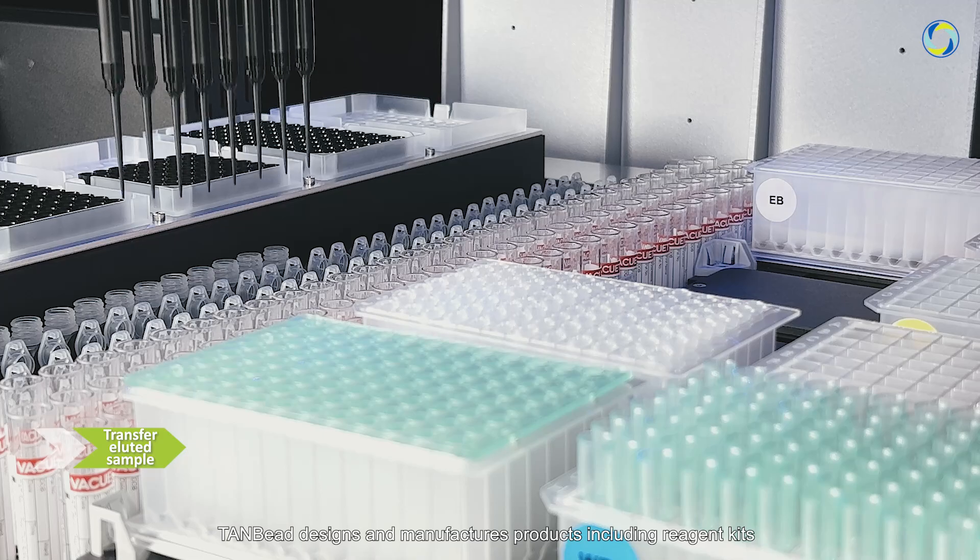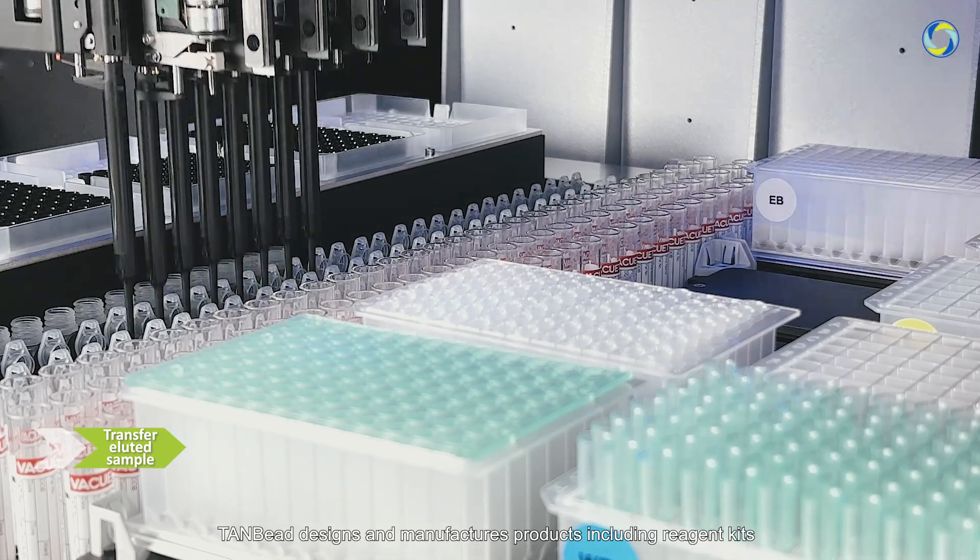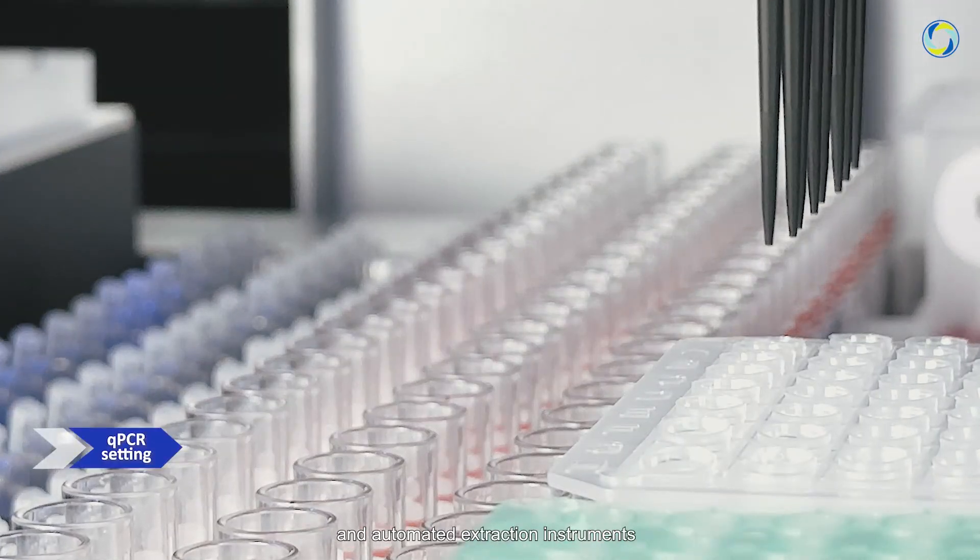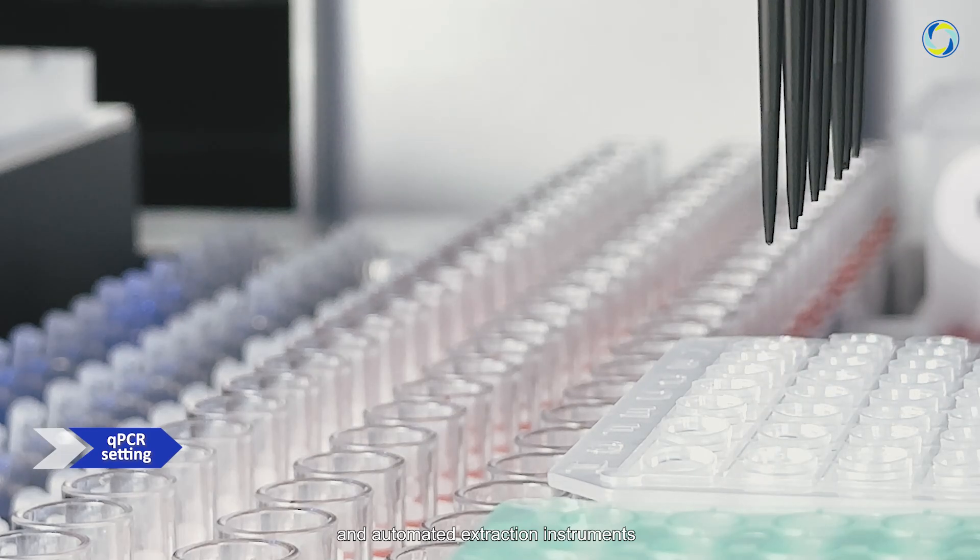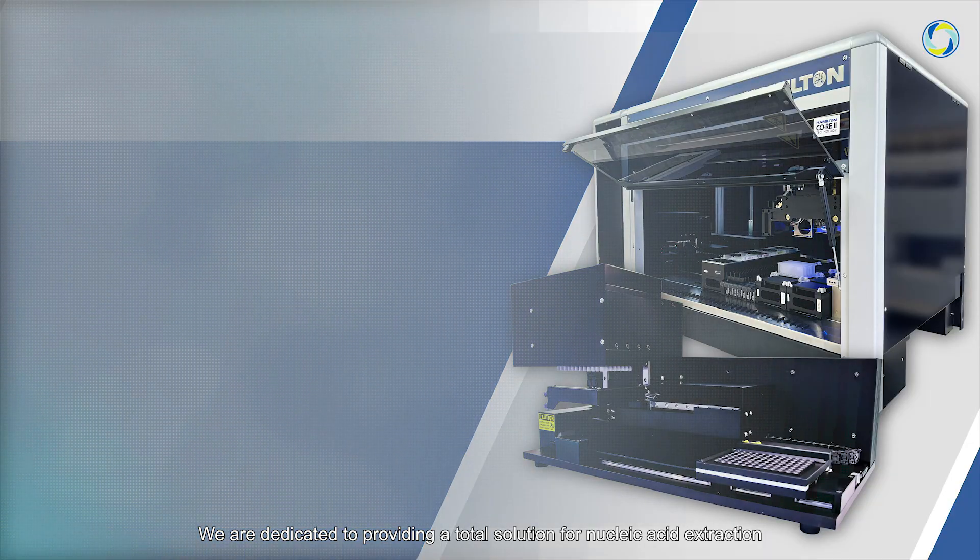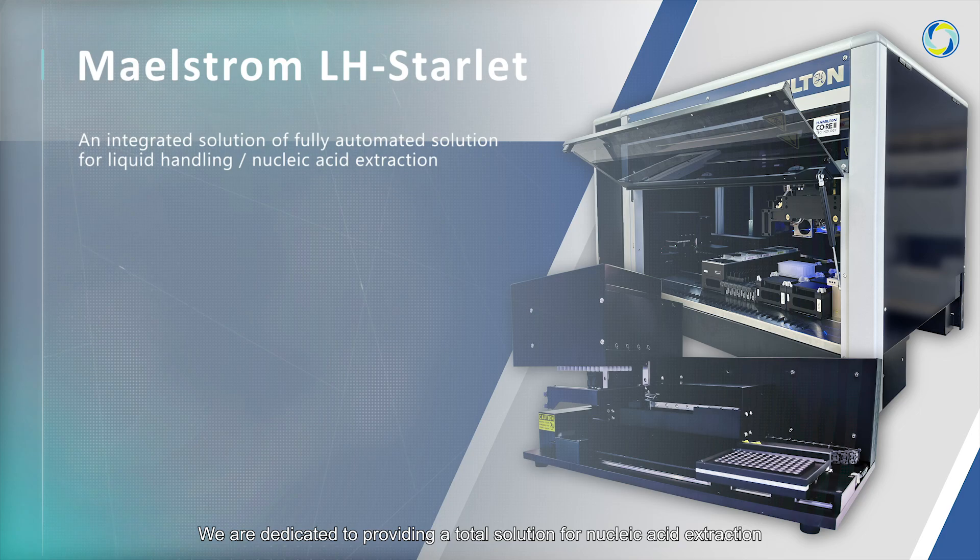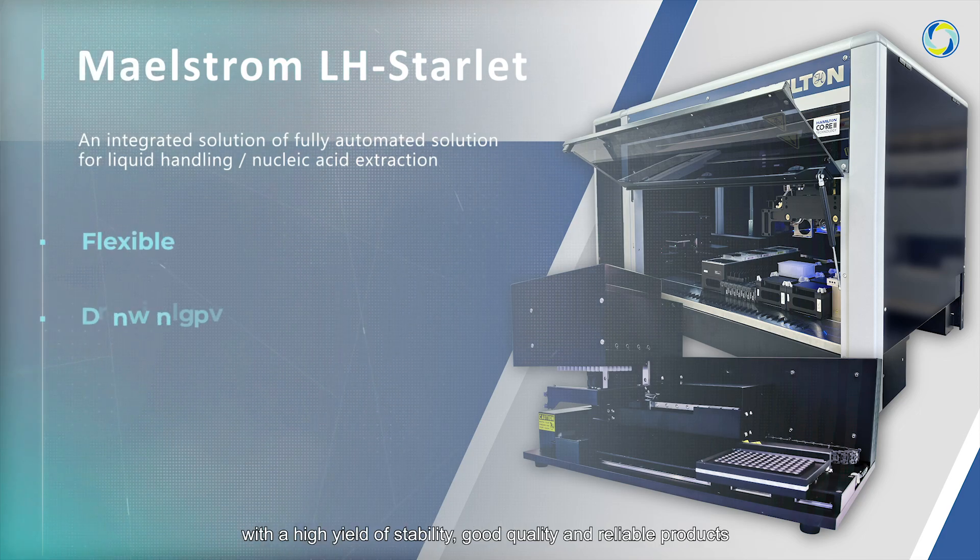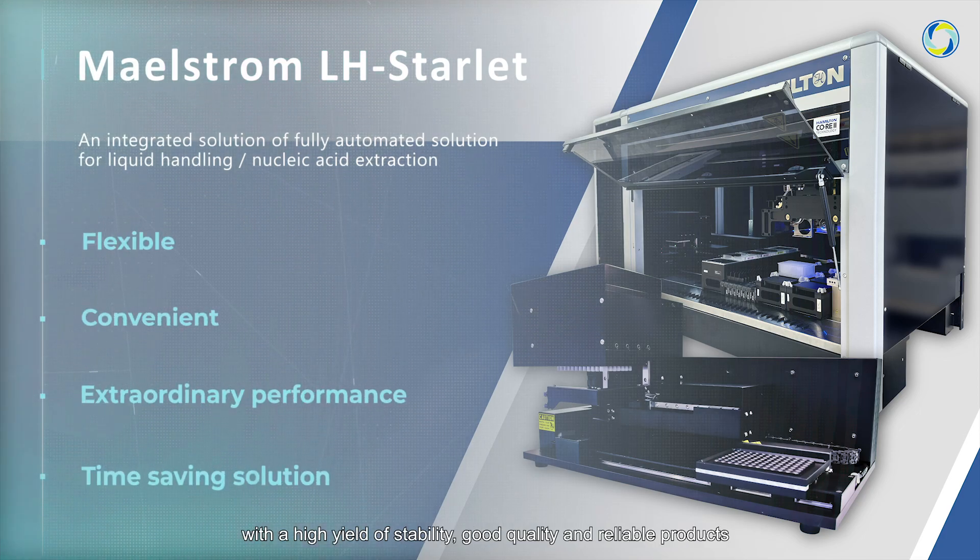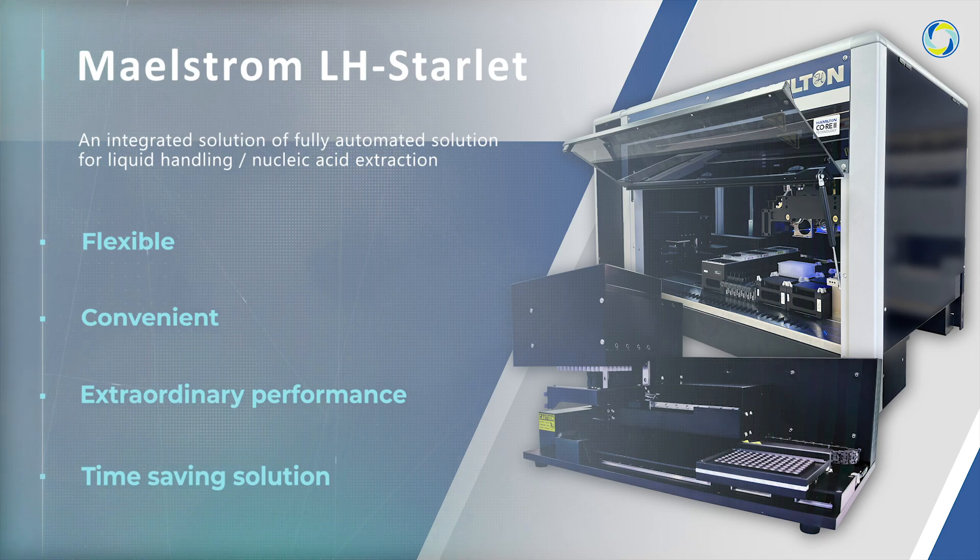Tan Bead designs and manufactures products including reagent kits and automated extraction instruments. We are dedicated to providing a total solution for nucleic acid extraction with high yield, stability, good quality, and reliable products.